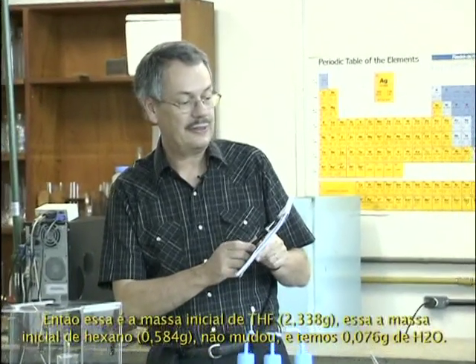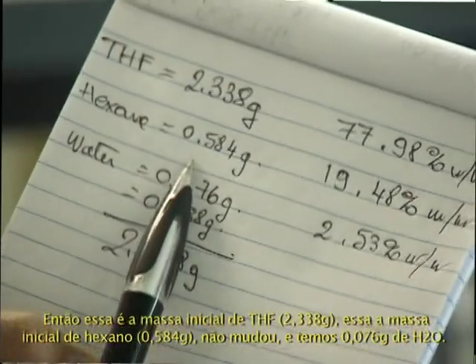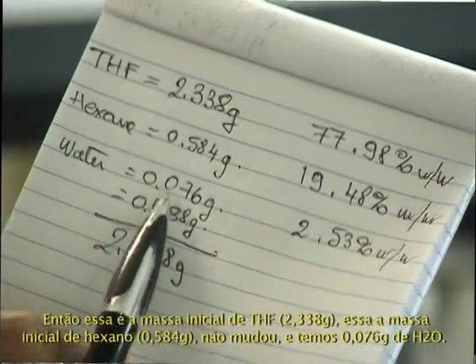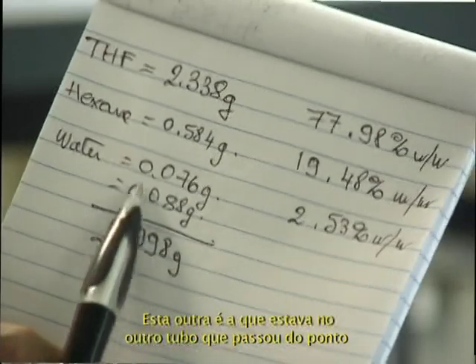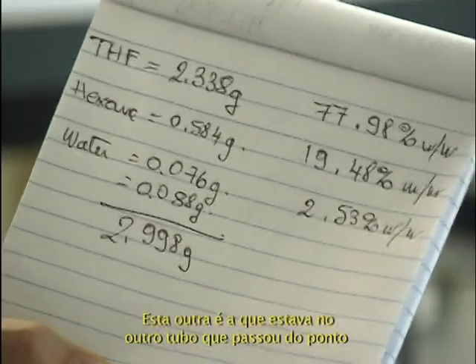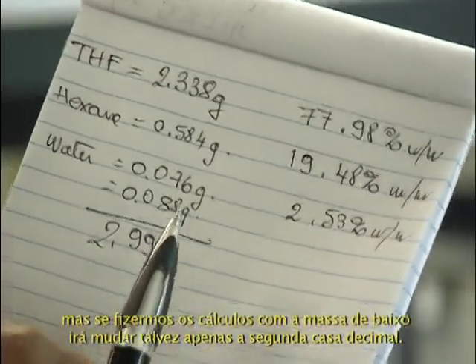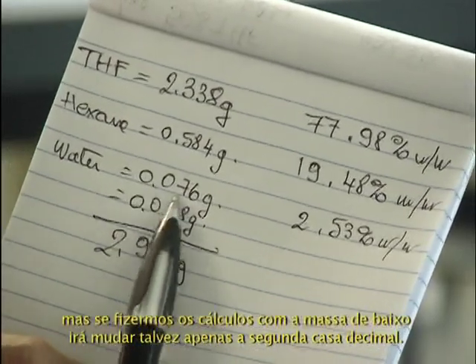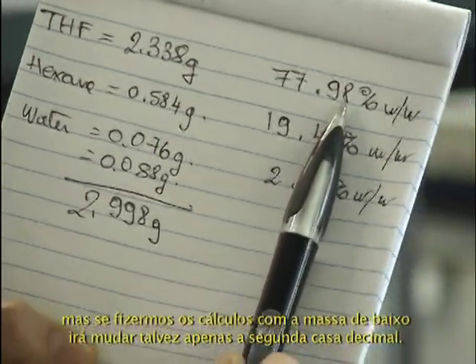So this is the initial mass of THF. This is the initial mass of hexane, which didn't change. And we add 0.076 gram of water. It could be that the second one is actually the one in this tube, but I think it's a little bit past. You see the change that makes. If you make the calculation with this mass instead of that one, I think it will change the second decimal, not the first.